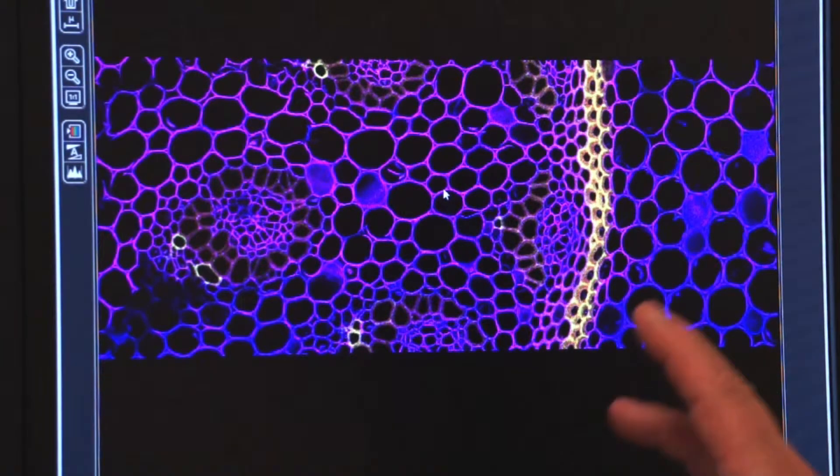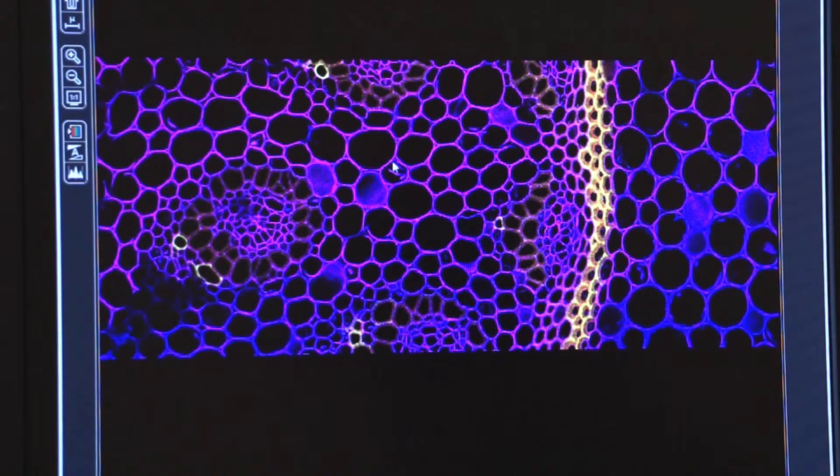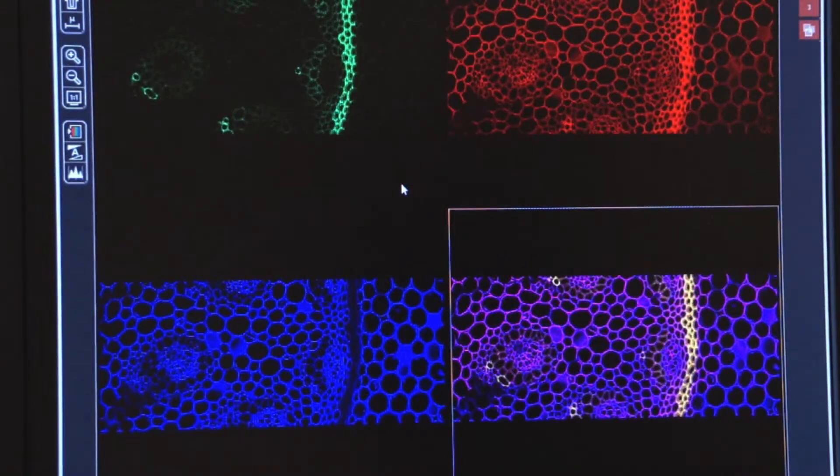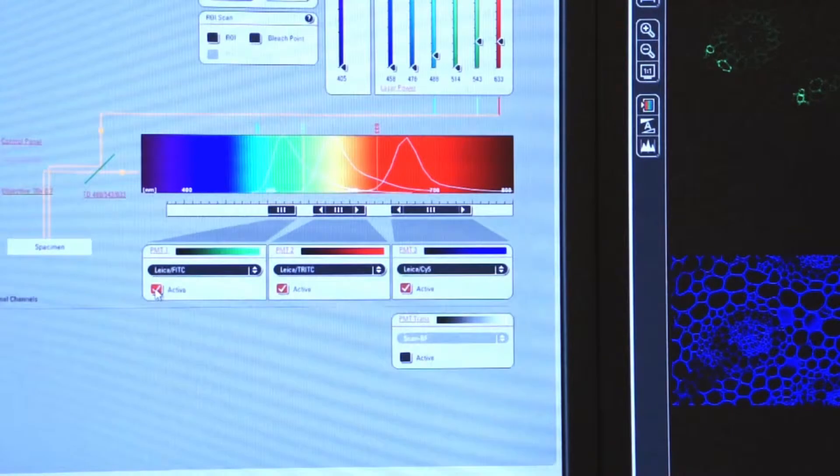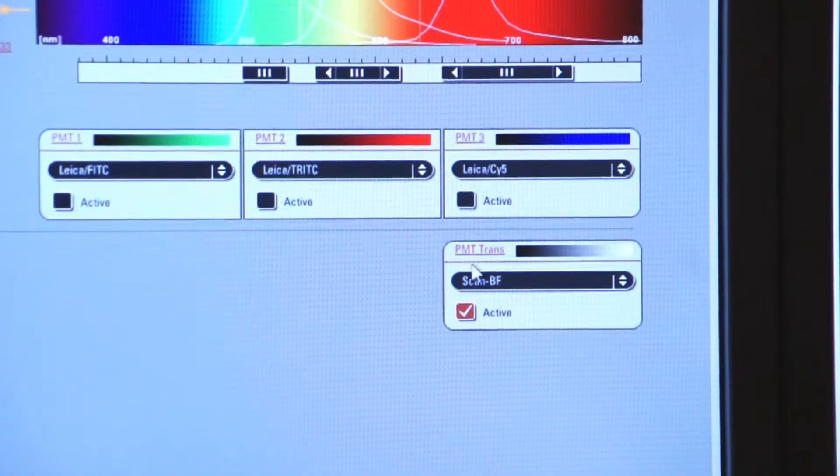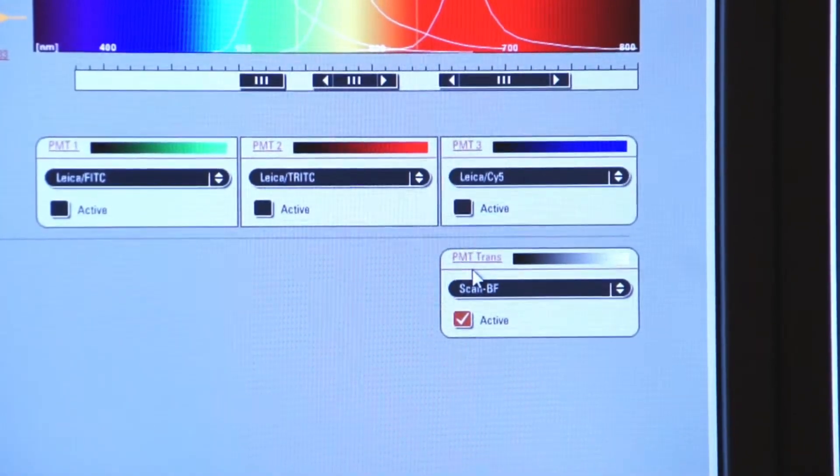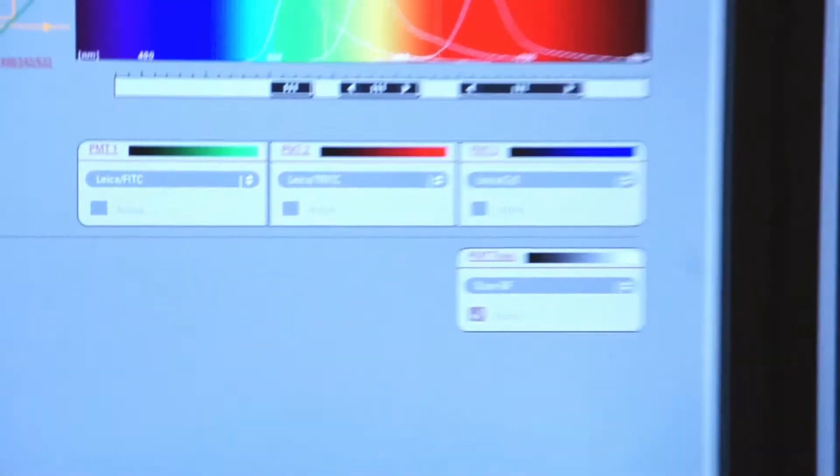One easy way to do this is to use the transmitted light PMT. We'll double click on the composite image. We're going to go over here and click on stop. Let's deactivate all three of the photomultiplier tubes, and we'll turn on only the bright field photomultiplier tube for transmitted light. Now if I click on live, here is my image in bright field.